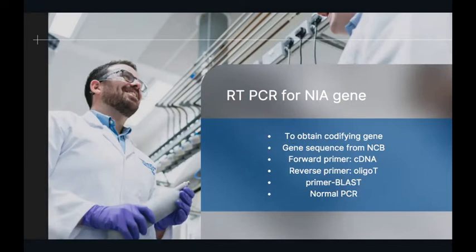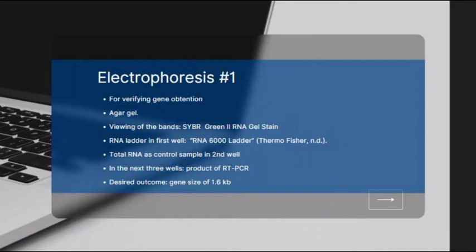So this will be followed by a normal PCR that has its four main parts. That is the initiation, the denaturation, where the hydrogen bonds are broken, then the annealing step, where the primers are annealed where they have to be so that the elongation can start, and the complementary and wanted sequences will then be amplified. Then comes an electrophoresis for verification of the procedure.